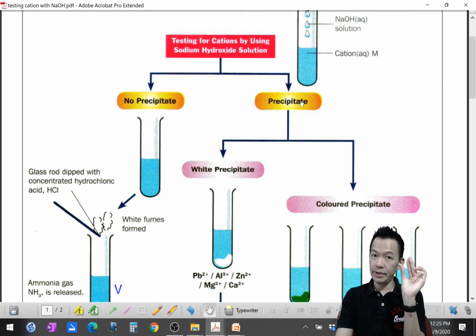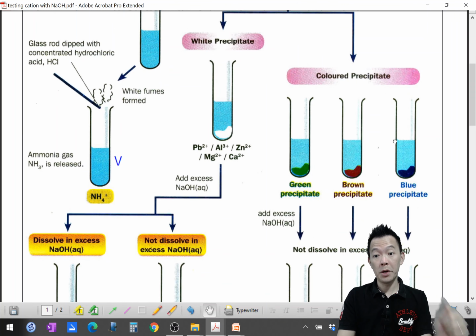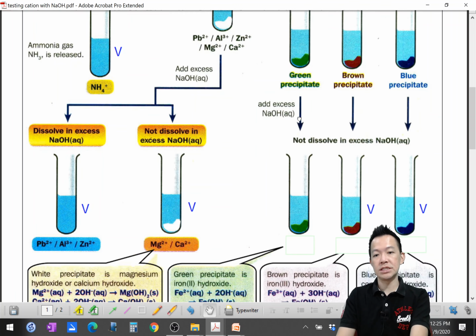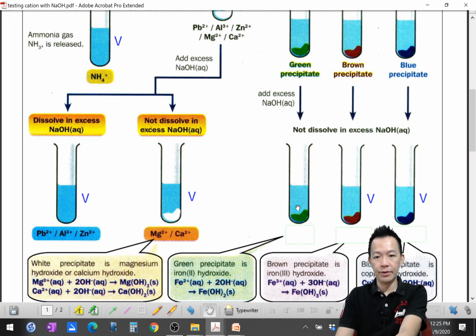OK, so next, prepare some salt solution, 准备一些盐水。Add sodium hydroxide solution. You can see the precipitate. But now the precipitate is color, 有颜色的哦. Okay? If the precipitate is color, you have to look at the color, 你必须看它的颜色. If the precipitate is green color, 如果它是青色呢, Okay? You add excess of sodium hydroxide, 你加多多. Okay? The green color precipitate is still insoluble, 它也是不能溶的.